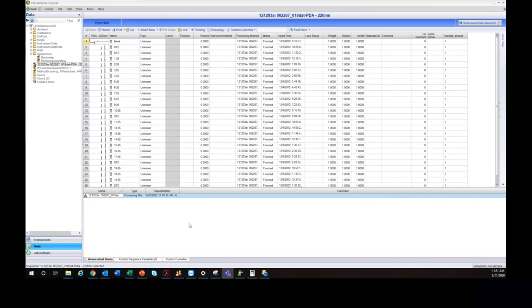In order to import data into Chromeleon, we need to open the console — the home screen. To get there, double-click the Chromeleon icon. I like to think of this as the pre-data acquisition area. This is where we create sequences, set up our injection list, control and equilibrate instruments, and launch workflows. No data processing is done in the console. When we process imported data, we do that in the studio.